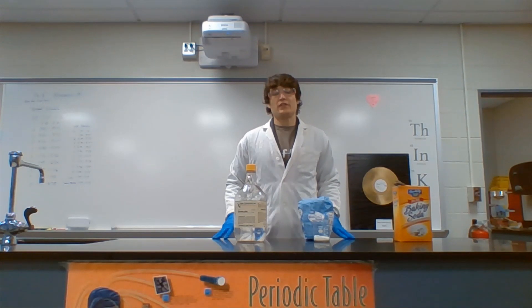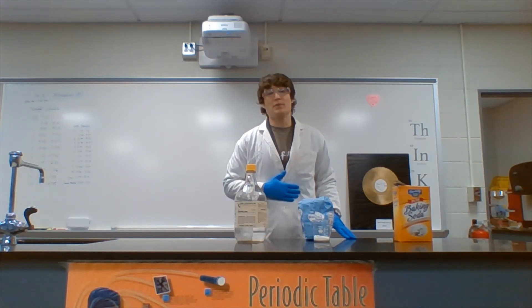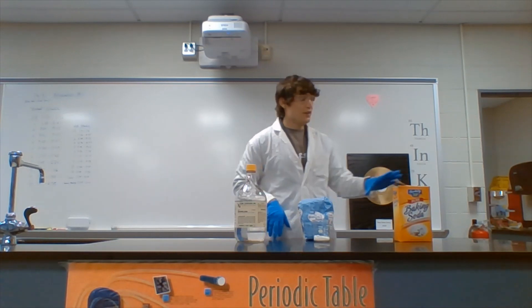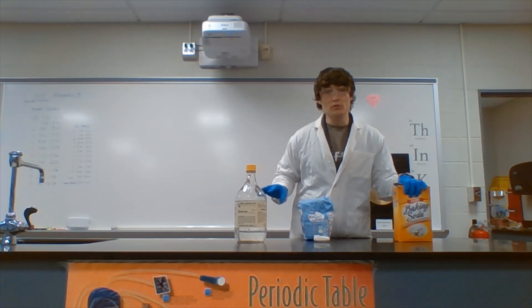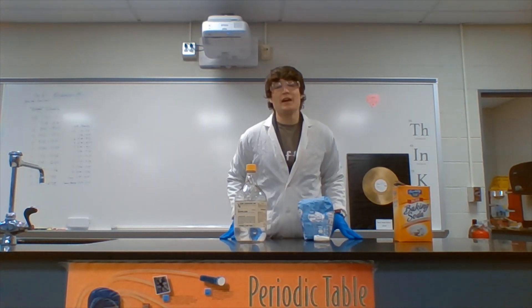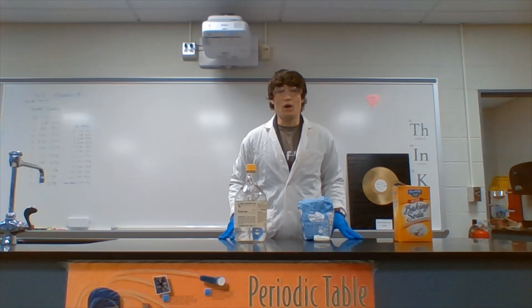For our next chemical reaction, we will be working with sulfuric acid, which is extremely damaging to human tissue. So to take some precautions, I have my lab coat, gloves, and glasses. I also have some baking soda, which will neutralize the acid should I need to. This chemical reaction is going to make carbon and water, so let's see how it works.